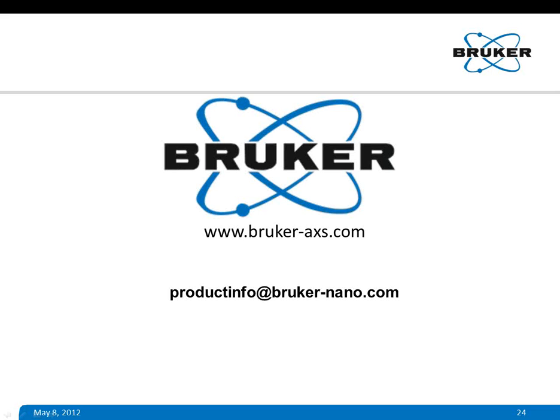Actually, I didn't cover this in the presentation, but I'll explain it now. This reference electrode is very important. It has to be preserved. Its tip has to be preserved. It should not get contaminated. Otherwise, you'll get all kinds of wrong potential measurements, and the whole experiment might go wrong. You'll get wrong data.